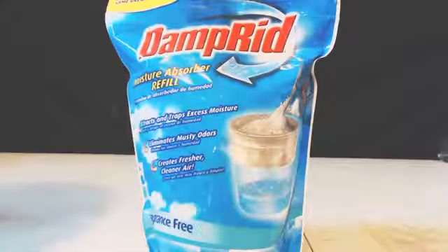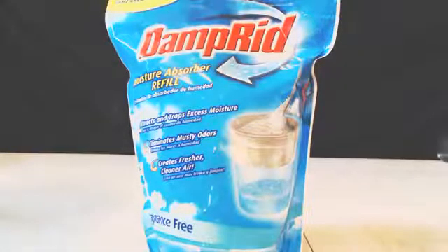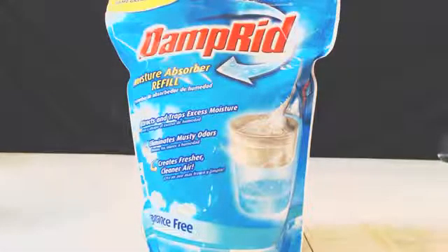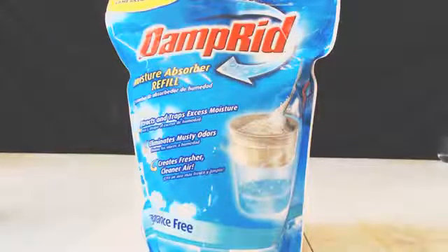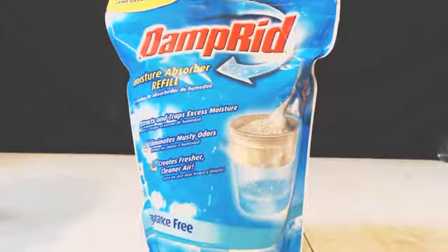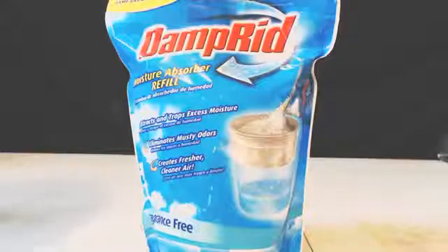This is used as a drying agent. I use magnesium sulfate a lot of times, but this is a good drying agent too. Sometimes you have to use this one because the magnesium sulfate will react. This is a good thing to have. Remember, before you use any drying agent, make sure that it doesn't react with what you're putting it in, to where there's going to be a fire or an explosion.